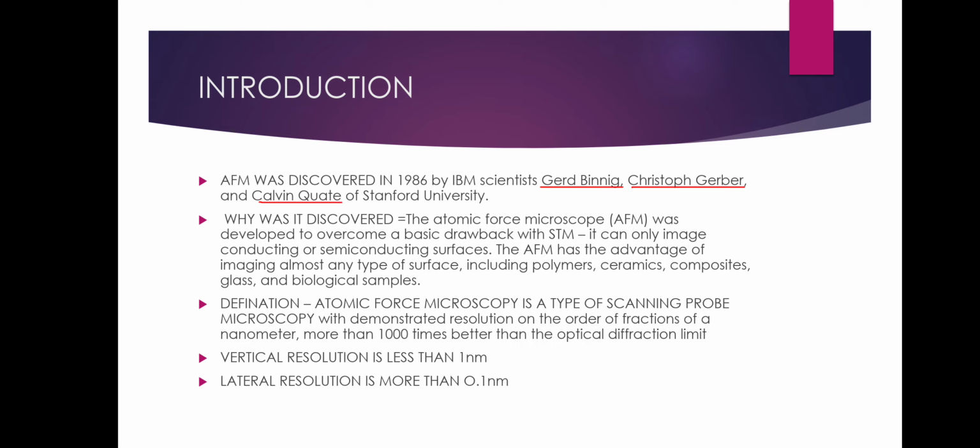The main reason for the discovery of the atomic force microscope was to overcome a basic drawback they were facing with the STM, or scanning tunneling microscope.